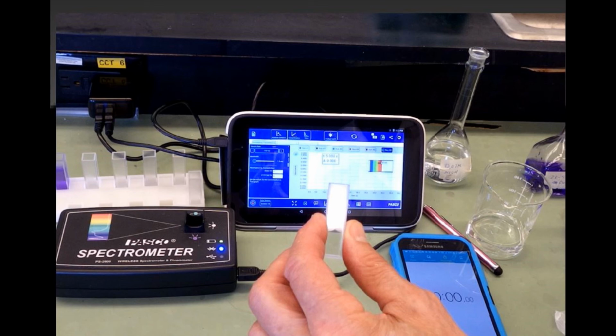And in Part C, you'll be varying the concentration of sodium hydroxide. And then you'll be able to determine the order of the reaction with respect to the hydroxide ion. You'll need to refer to the procedure and your instructor for doing that. These runs are only 60 seconds long because you'll be measuring the initial rate.